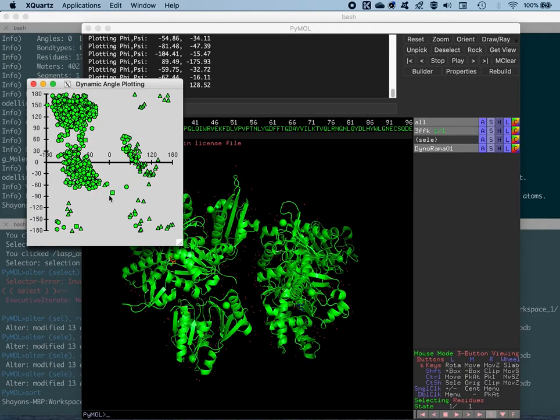Again, here's the thing with the proline residue. Although its side chain is cyclic and supposed to be highly steric in nature, and it occupies a region around negative 60 degrees on the phi axis, which is the x-axis, which you can find out here with all the squares, sometimes there might be some proline residues which occupy these regions, which belong to the coil or the turn, the more flexible regions of the protein. The reason being, it's easier for them to move around in that region, even with that sturdy or sterically hindered side chain.